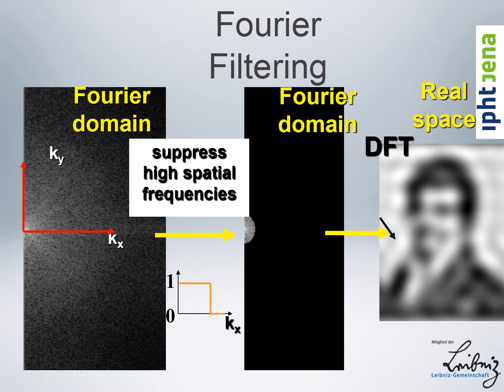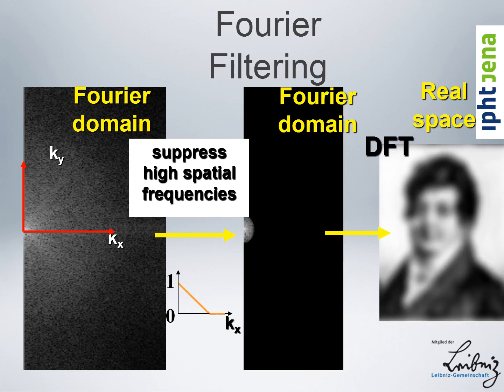So where a point is, there is a dark fringe, and that's because we cut it away very, very sharply. We can ameliorate that a little bit by having a more triangular decay, as shown here. And you see it looks like most of the fringes are gone. If you really measure this, there are still some fringes there, and it turns out you can never get the fringes really to go away, but you can make it such that the total result never becomes negative.